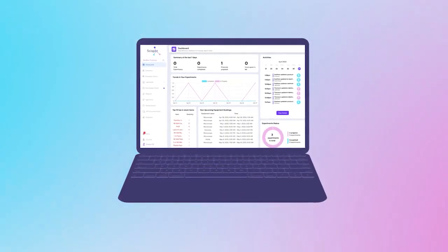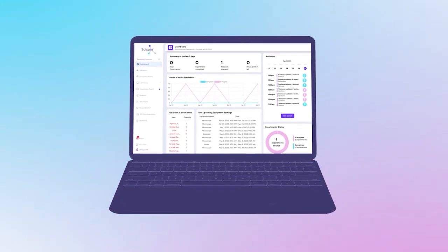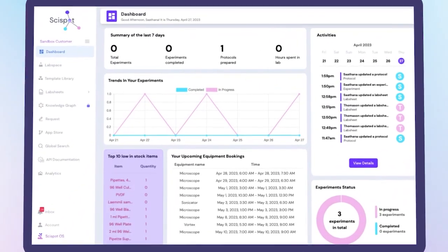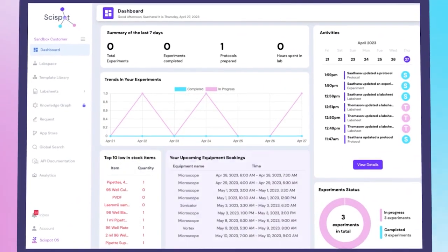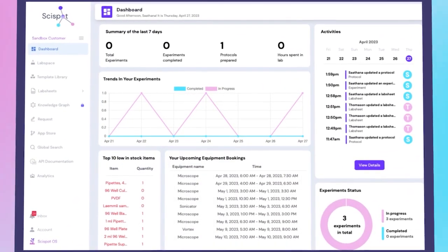Let's start by taking a closer look at our dashboard. Here, you can see inventory levels and equipment booking slots in real time.